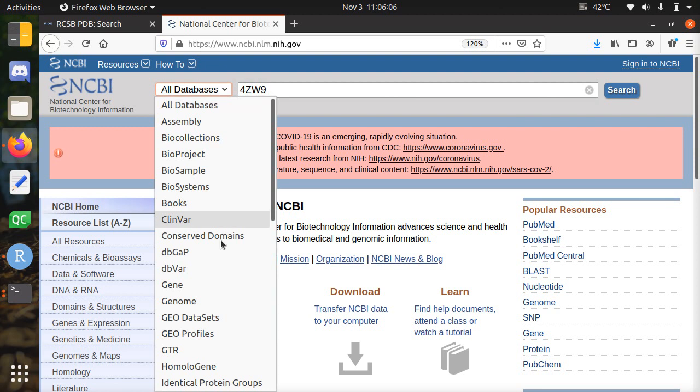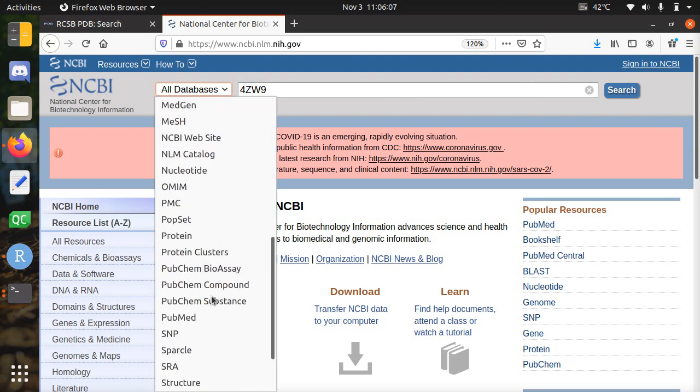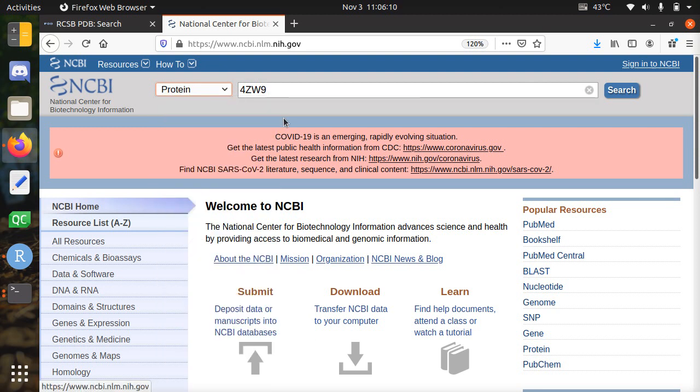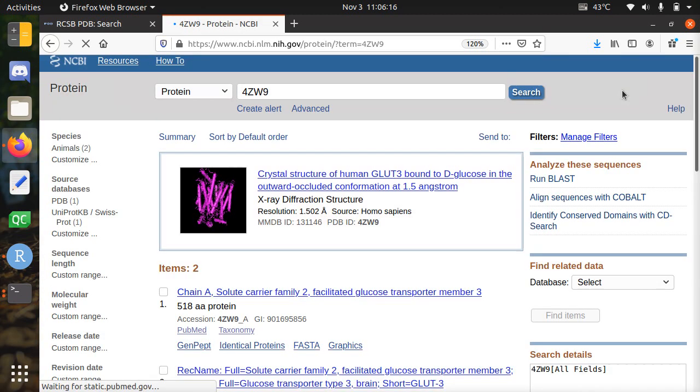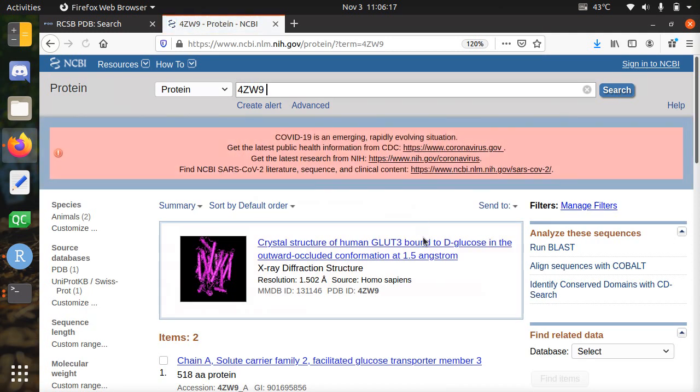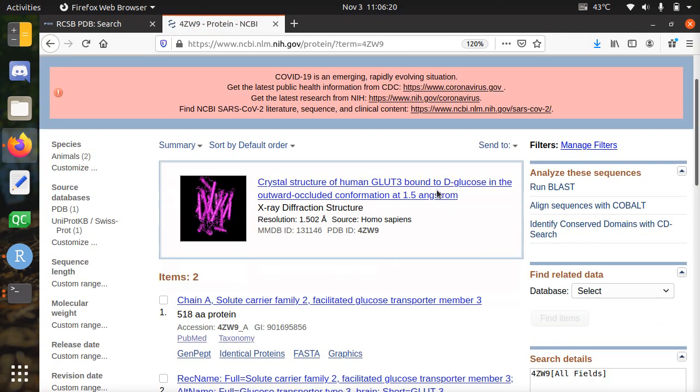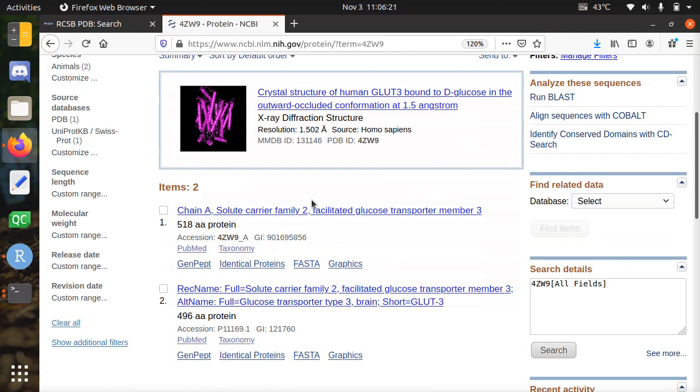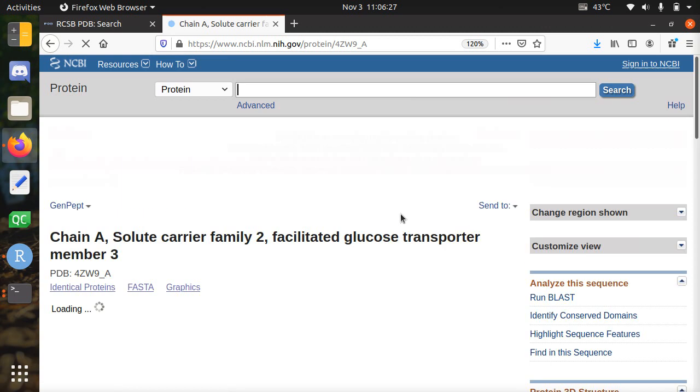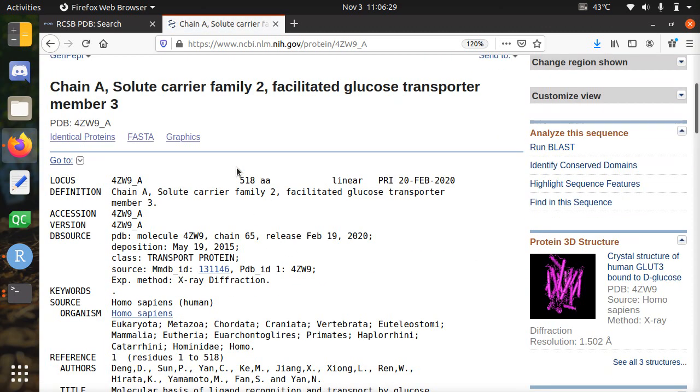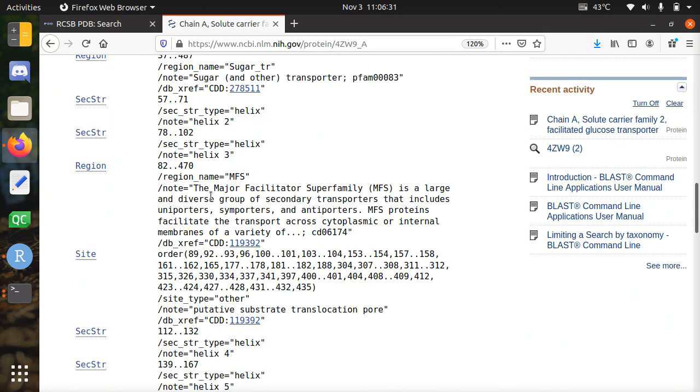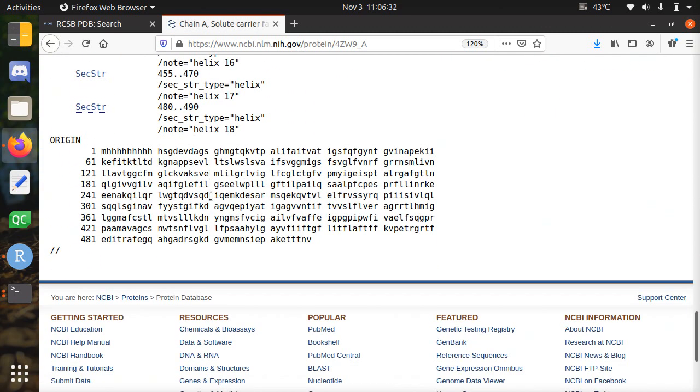I'm clicking that it's a protein. Actually, it uses a different database. The cool thing about NCBI nowadays is it has a diffuse search, so you can actually leave out the protein and it will give you this. So here we have our protein. There are two, and I'm going to use the first one. That brings me to the page about this protein, so that's great. I already have the sequence here.